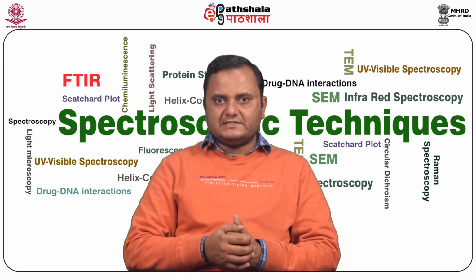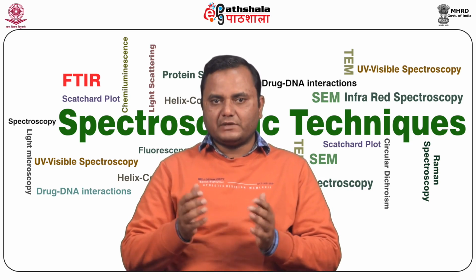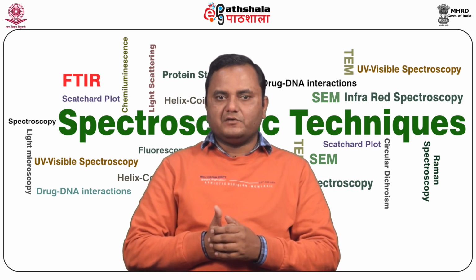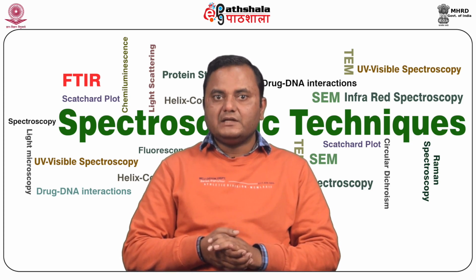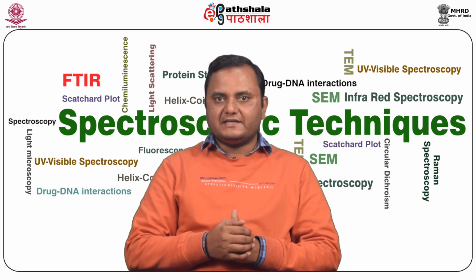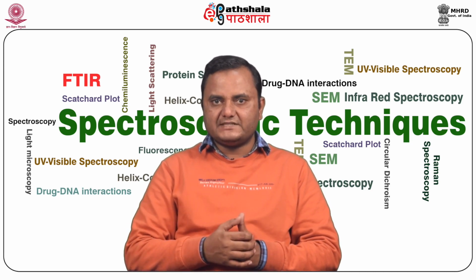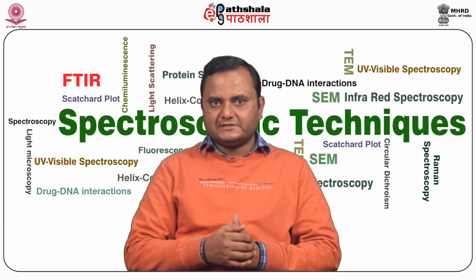Then alpha is an angle between the initial plane of the polarization and the major axis of the ellipse of the resultant transmitted light. The quantity phi is defined such that tan phi is the ratio of the major and minor axis of the ellipse of the transmitted light.